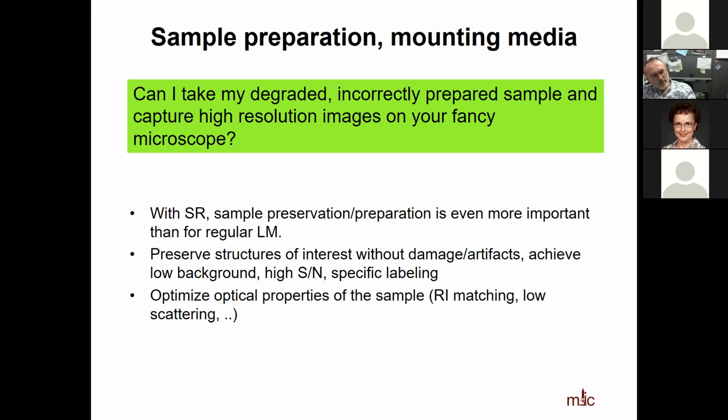I think for moving things that go fairly fast, I would say looking at light sheet, if your sample is transparent enough. Holly will be able to tell you more, if she's still on. I think she got off. Anyway, Holly Gibbs from MIC is doing light sheet microscopy, so she might be able to tell you more specifics. That would let you combine fast volumetric imaging with hopefully some reasonable localization of small emitters. Right, if you can do it right. Okay, thanks.